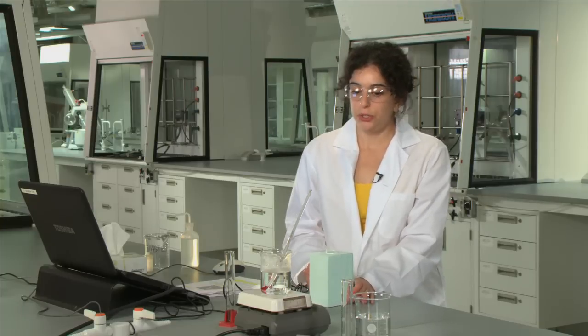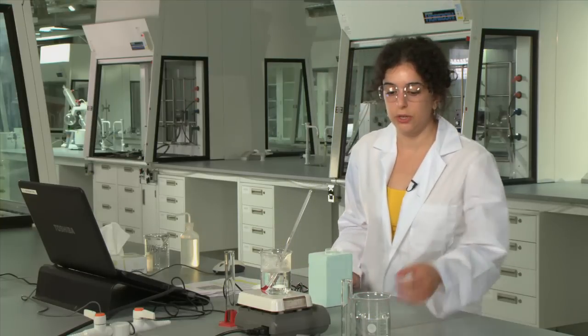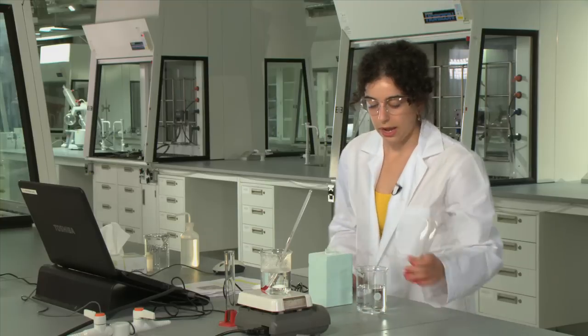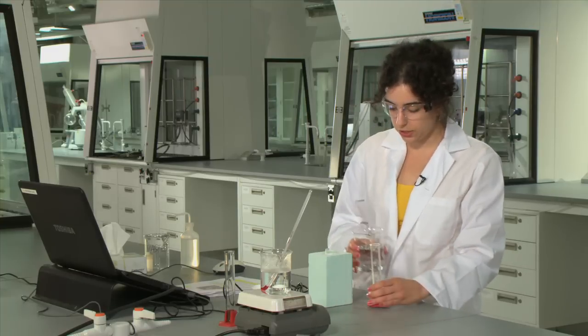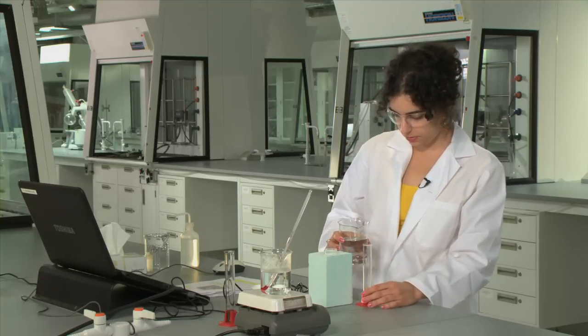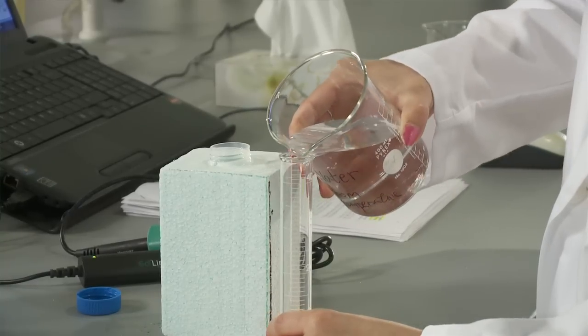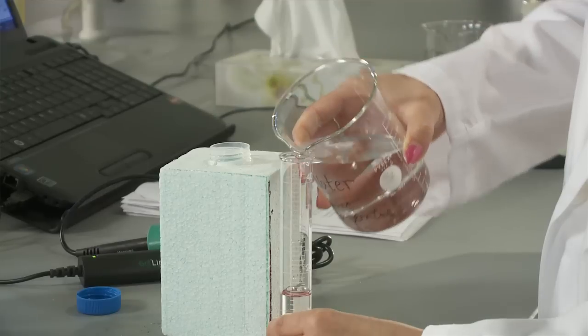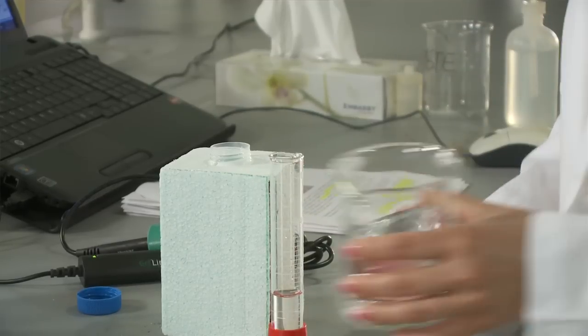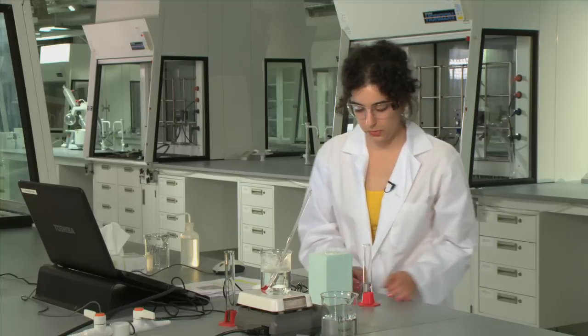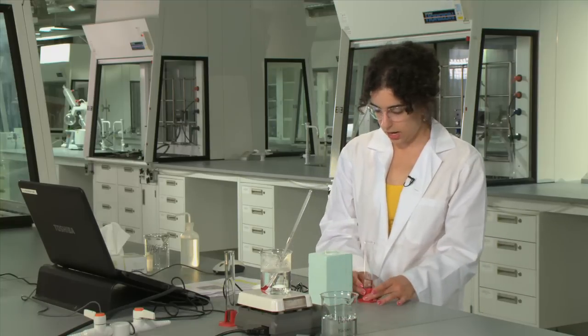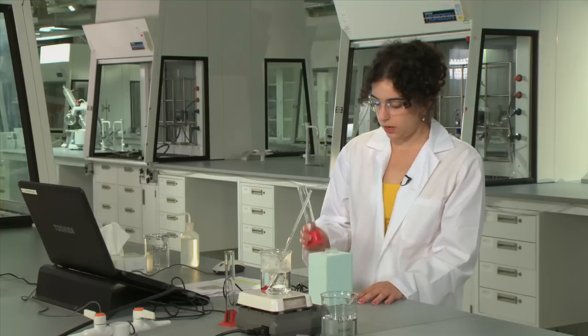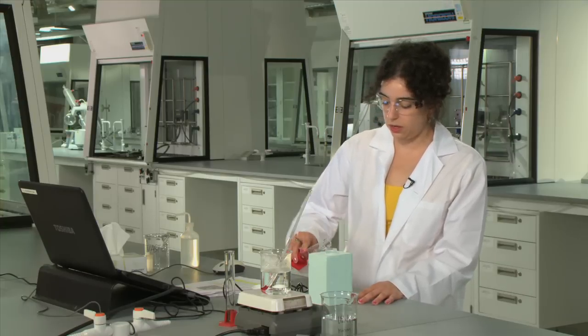So to do this what we're going to do is take 15 milliliters of room temperature water and we're going to measure this out with a graduated cylinder. And we're going to put our water in the calorimeter.